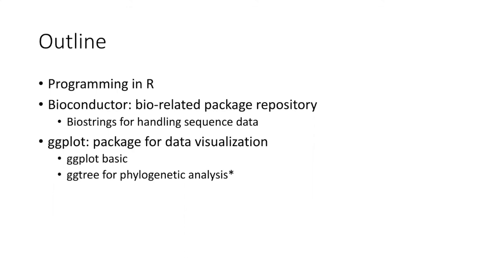I will talk about some of the basics of ggplot, like the foundation, the theories behind it, and also the basic structure, how to code in ggplot. And then I will do some live demo to show you how to do this in real time. And then if I have time, I will talk about ggtree. This is a package that is built upon the ggplot foundation. It uses the same idea, the same theory, but it extends ggplot's capability for phylogenetic analysis in specific. So if you are studying evolutionary genetics or phylogenetics, it will be very useful to know ggtree to help you do more advanced phylogenetic analysis visualization.